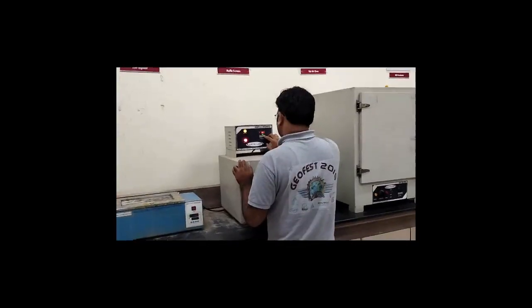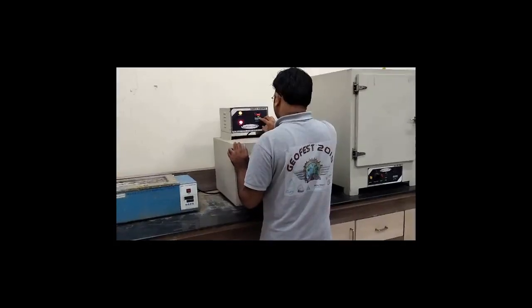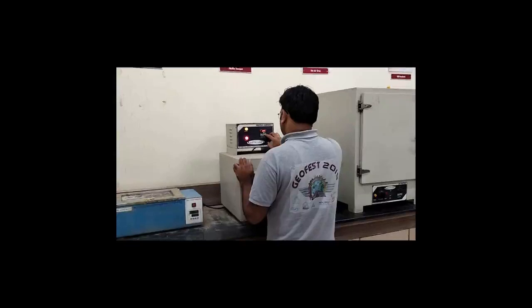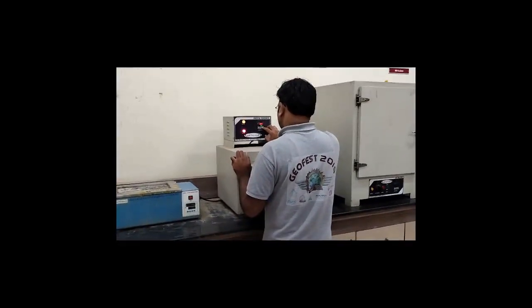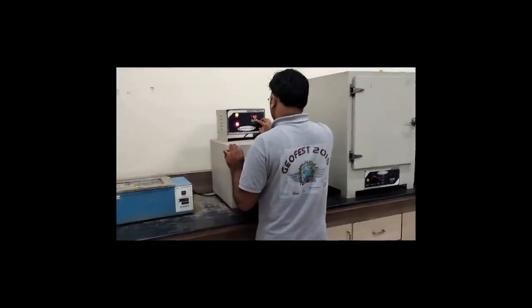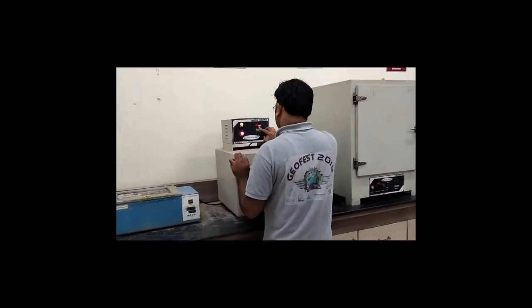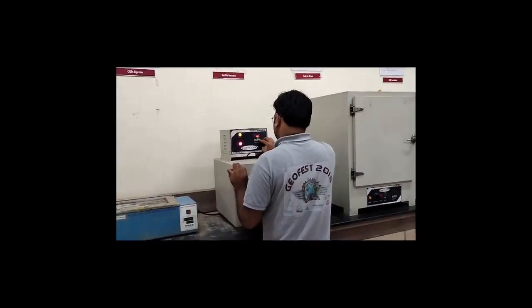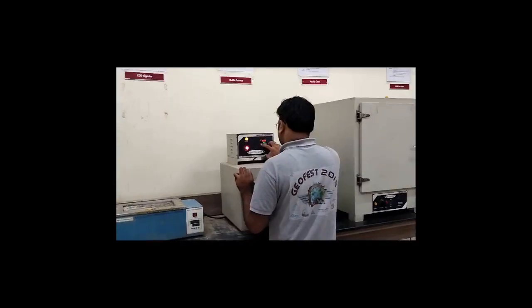It can handle temperatures of up to 1200 degrees Celsius. I'm going to keep it at 550 only. Okay, it is 550. I'll be setting this temperature.